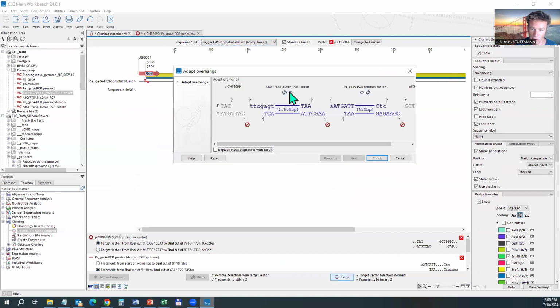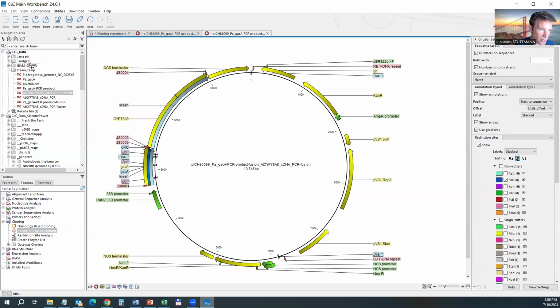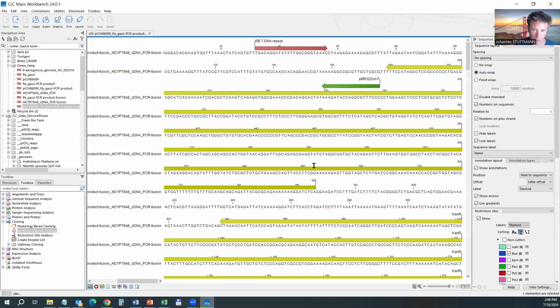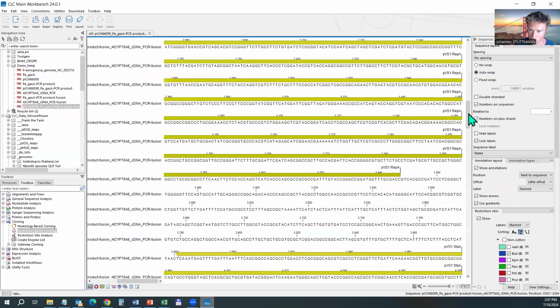now it works. And now I can actually change the order here. So you see, there is no button to say, try to make it fit. I have to actually find out how it works. And for that, I need some meaningful names because otherwise it's just trial and error if I don't remember what I did. So now I just save this again, close everything. And what I should get now, I can check whether the stuff I did is correct.